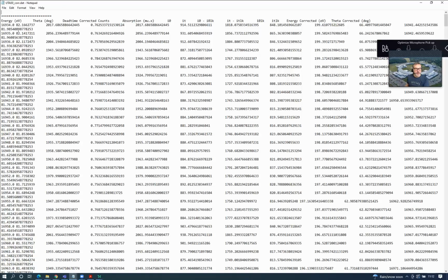Okay, and so if we compare these values, so 16934.0, 16941.4, you can see that there's a very significant energy miscalibration, a 0-point error in the spectrometer to be corrected for. And then similarly here for the two theta values. So the final data file in this case contains all the component data for you to work with and be able to plot in Athena if you choose to.